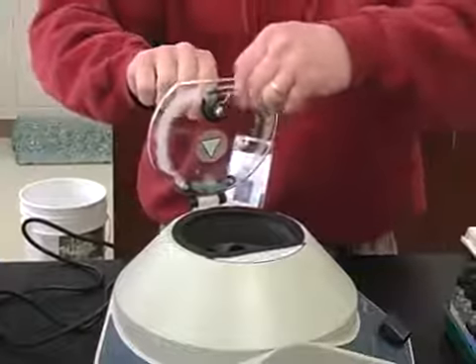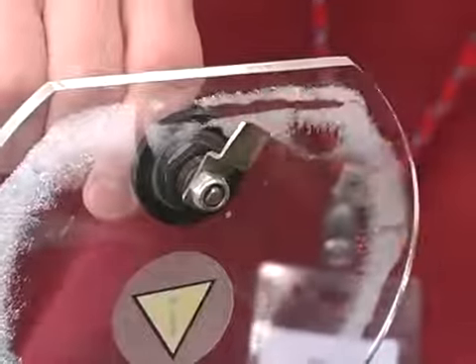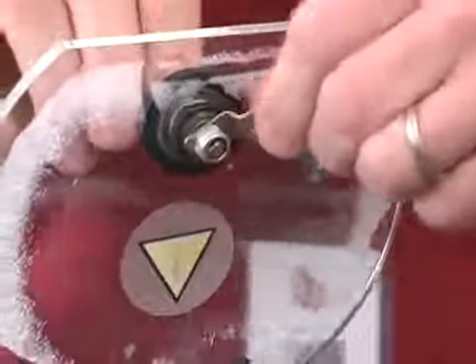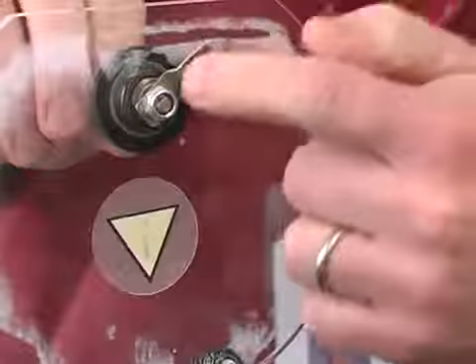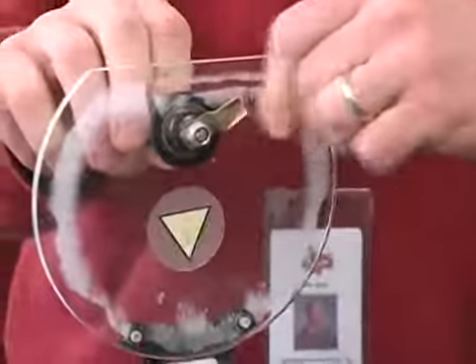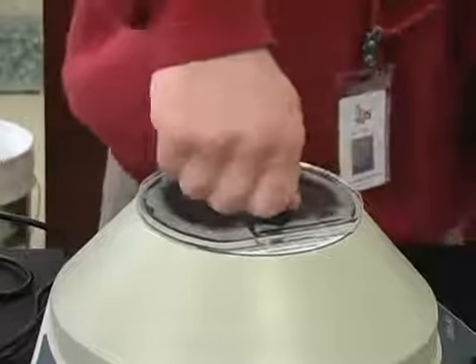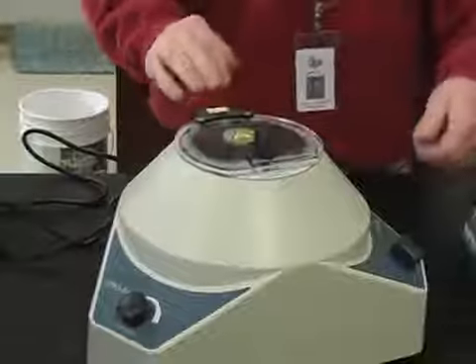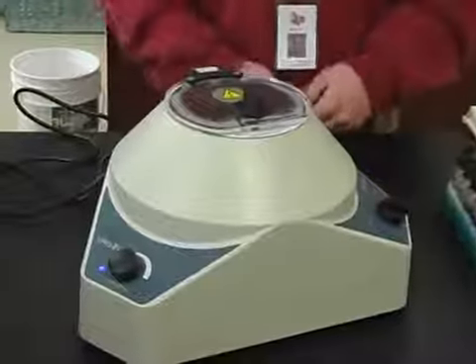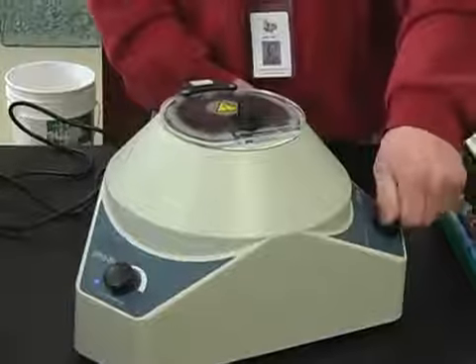And this part of the cover right here is actually a conductor of the electricity that runs through and makes it spin around. So if it doesn't work sometime when you're closing it, you probably know that maybe this needs a little filing down, or it's just not conducting real well. So once you load the centrifuge properly, close the top of the centrifuge, and then you turn the knob and make sure that it engages properly with the inside of the centrifuge. Then you can turn it on, and generally you want to centrifuge for 2 to 3 minutes.